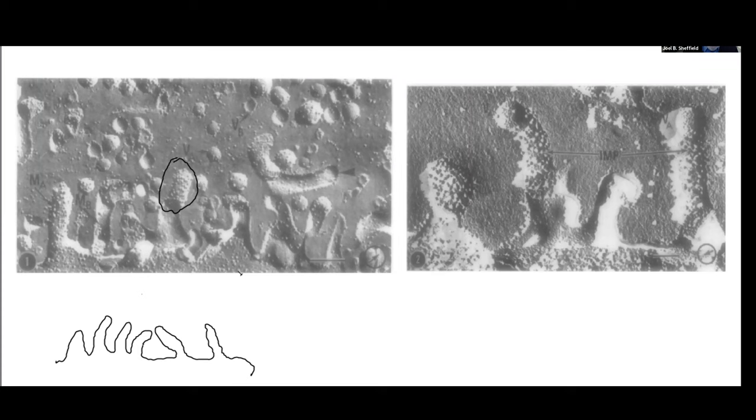So if we look at this thing again as a membrane, what we're suggesting is that in this particular membrane, those intramembrane particles stay associated with one surface and not with the other. And this was known for a number of examples. So that's one way of looking at these microvilli, again, to get an interesting perspective.